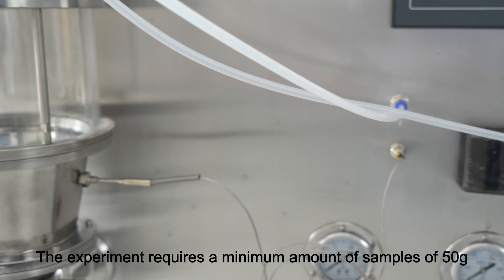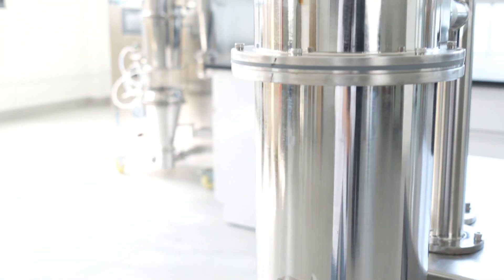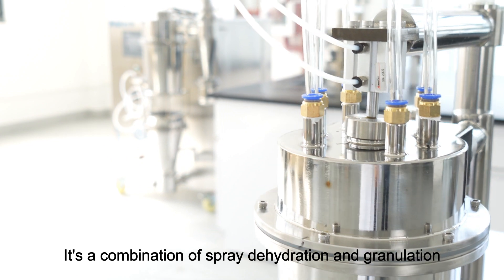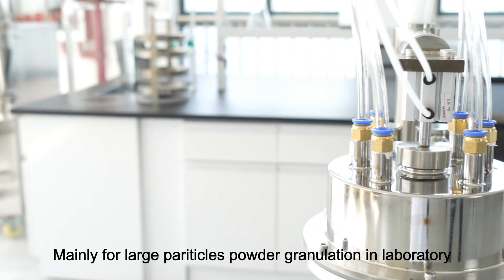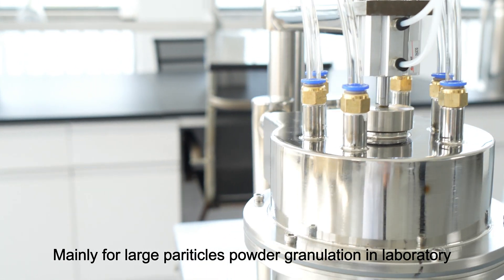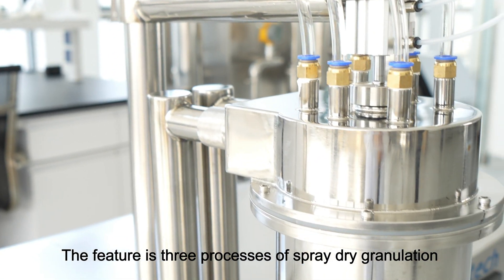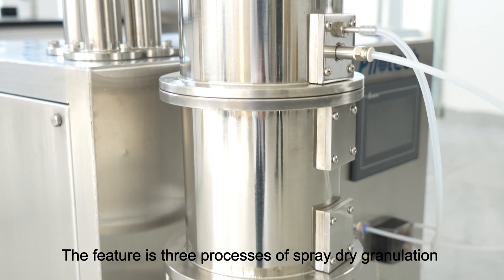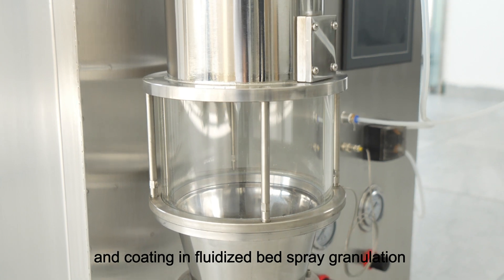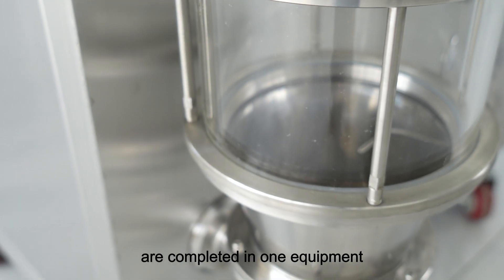The experiment requires a minimum amount of samples of 50 grams. It's a combination of spray dehydration and granulation, mainly for large particle powder granulation in the laboratory. The feature is that 3 processes — spray dry, granulation, and coating — in fluidized bed spray granulation are completed in one equipment.